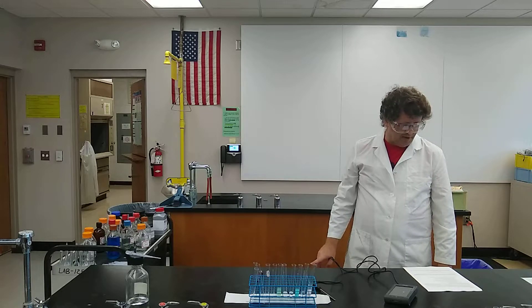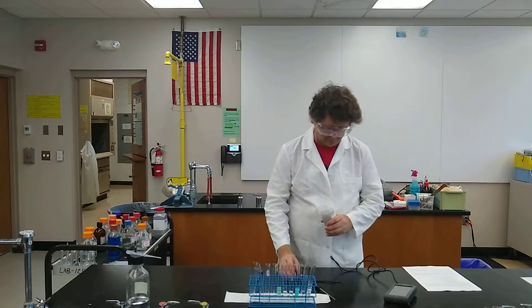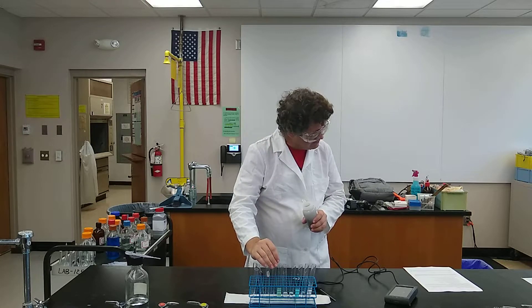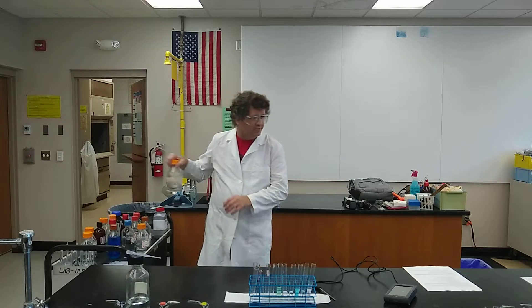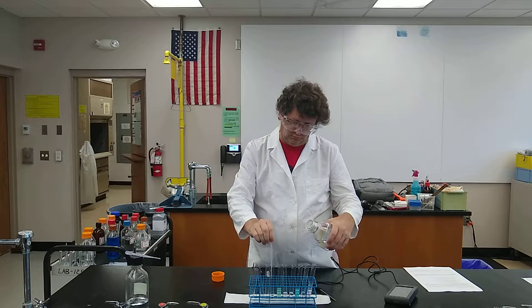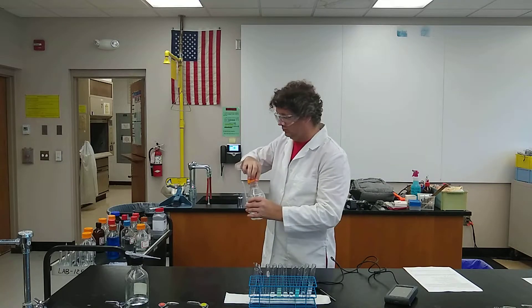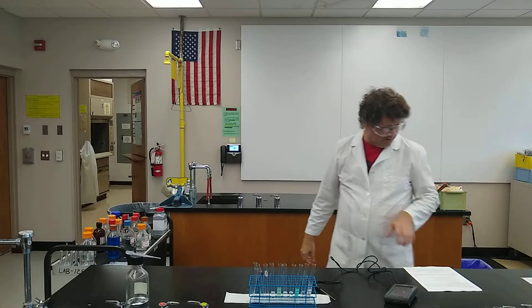Number seven: copper metal again, but this time it's with zinc sulfate. I'm going to put my copper in — we've got about the exact same size of copper as we did before. And zinc sulfate goes in as well. At least right now, it's just a wet piece of copper. We'll let that sit.